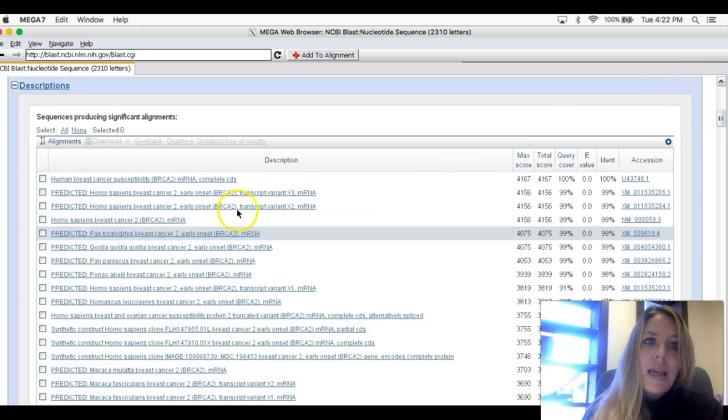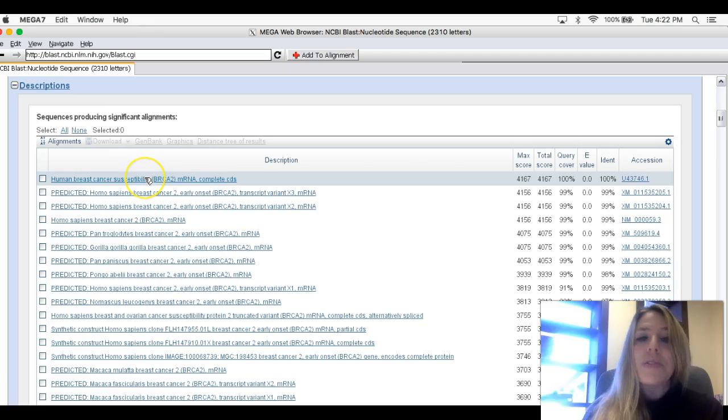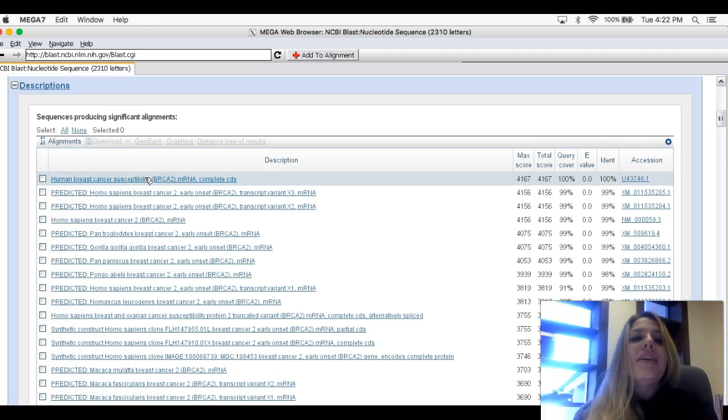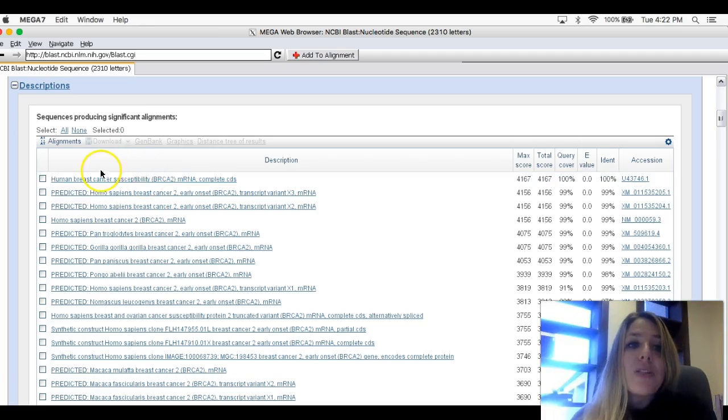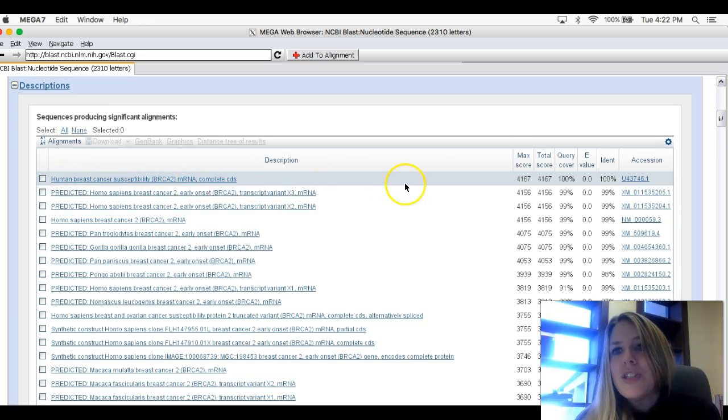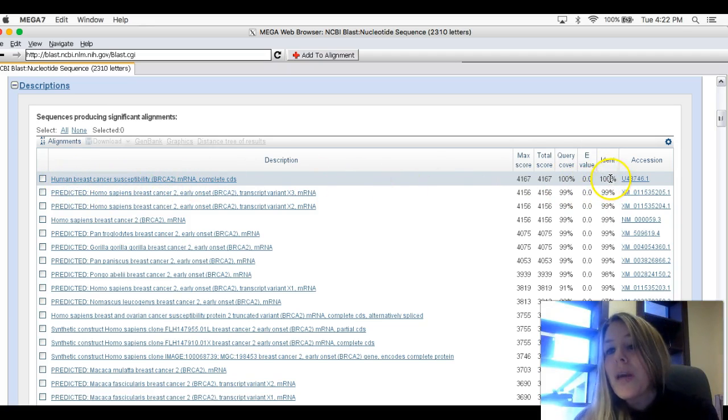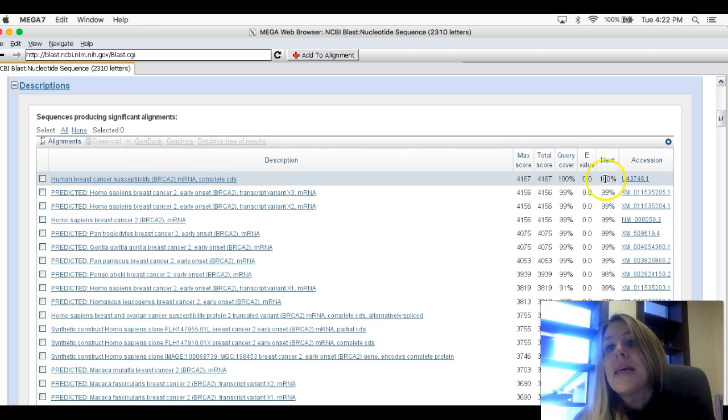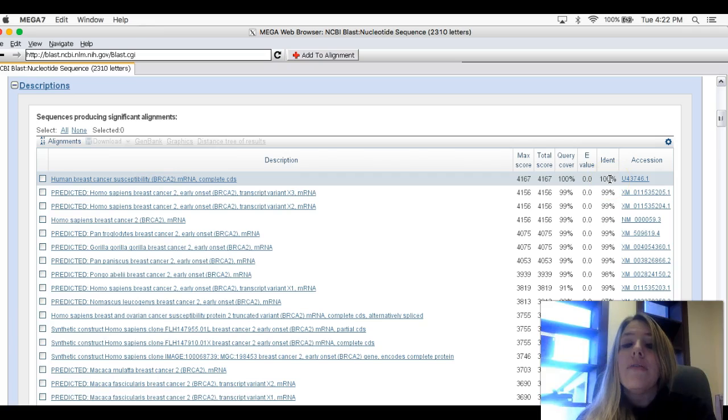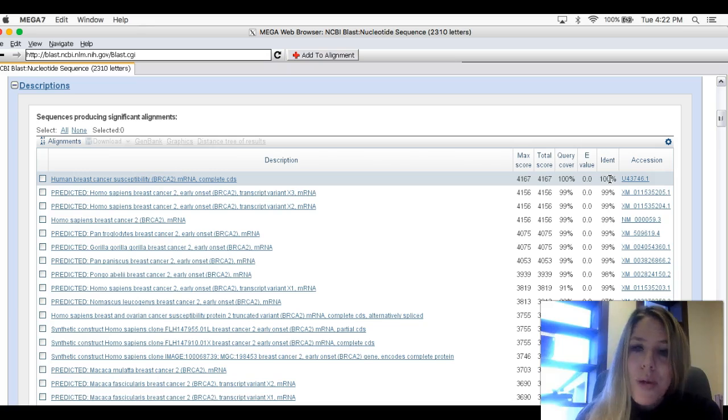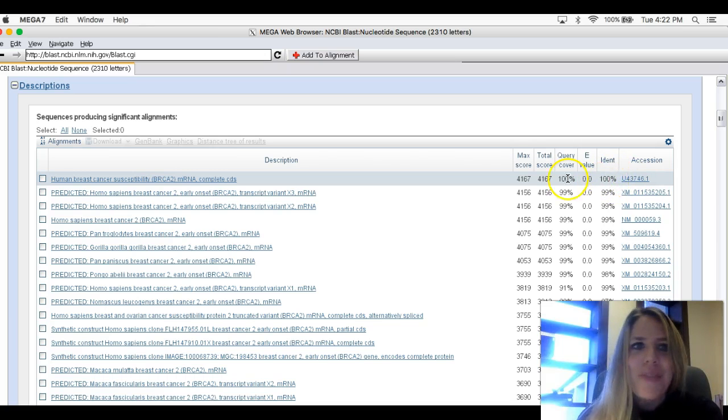I'm going to scroll down, and then we get to the actual entries. Each one of these entries represents a different one of those red lines up there. The first one is always the one you queried, human breast cancer susceptibility gene. If you scroll over to the right here, you should see identity, which means what percent of the DNA sequence is identical to the one we queried. Since this is the one we queried, it should be 100%.